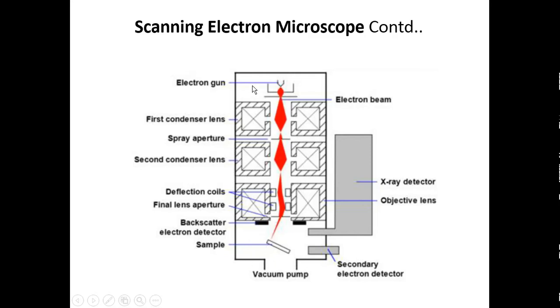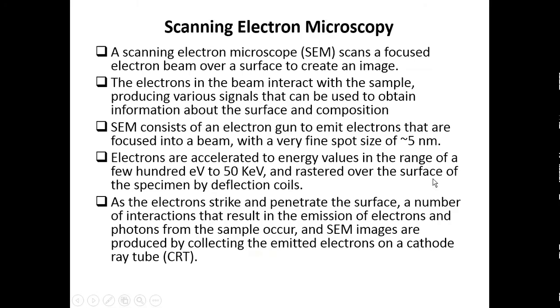And this beam and all these other things are kept in a vacuum environment. Actually, this is a vacuum chamber in which all these phenomena are taking place. Okay, that is what I have given here.